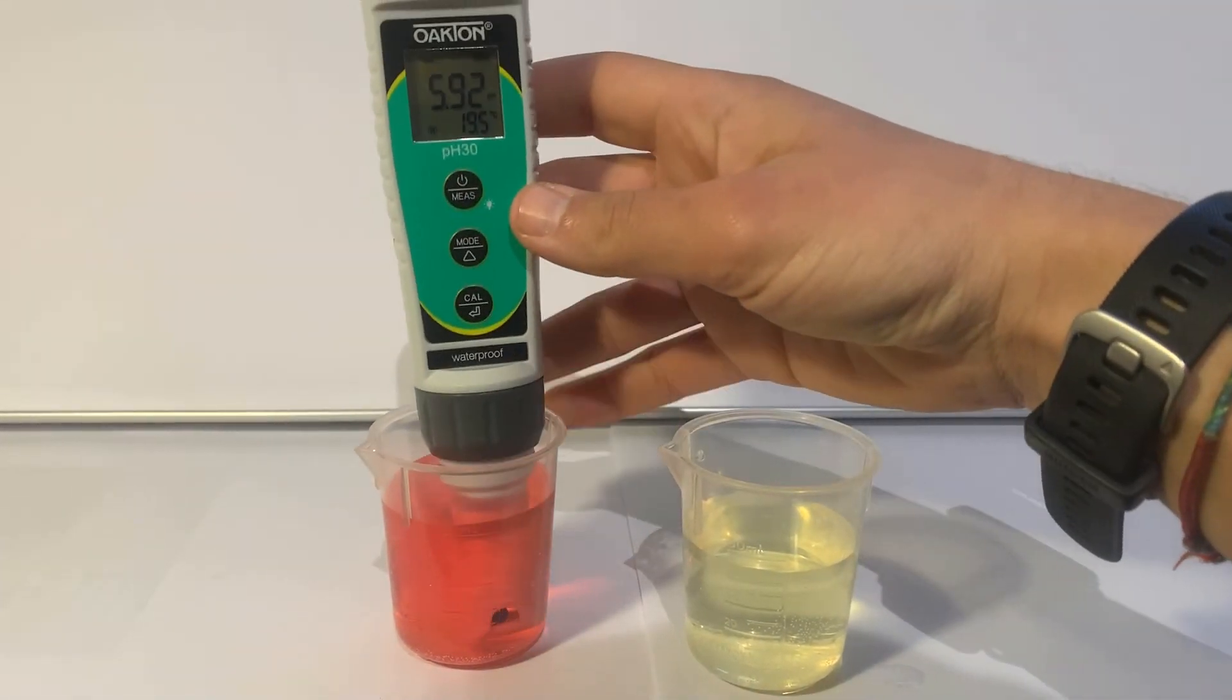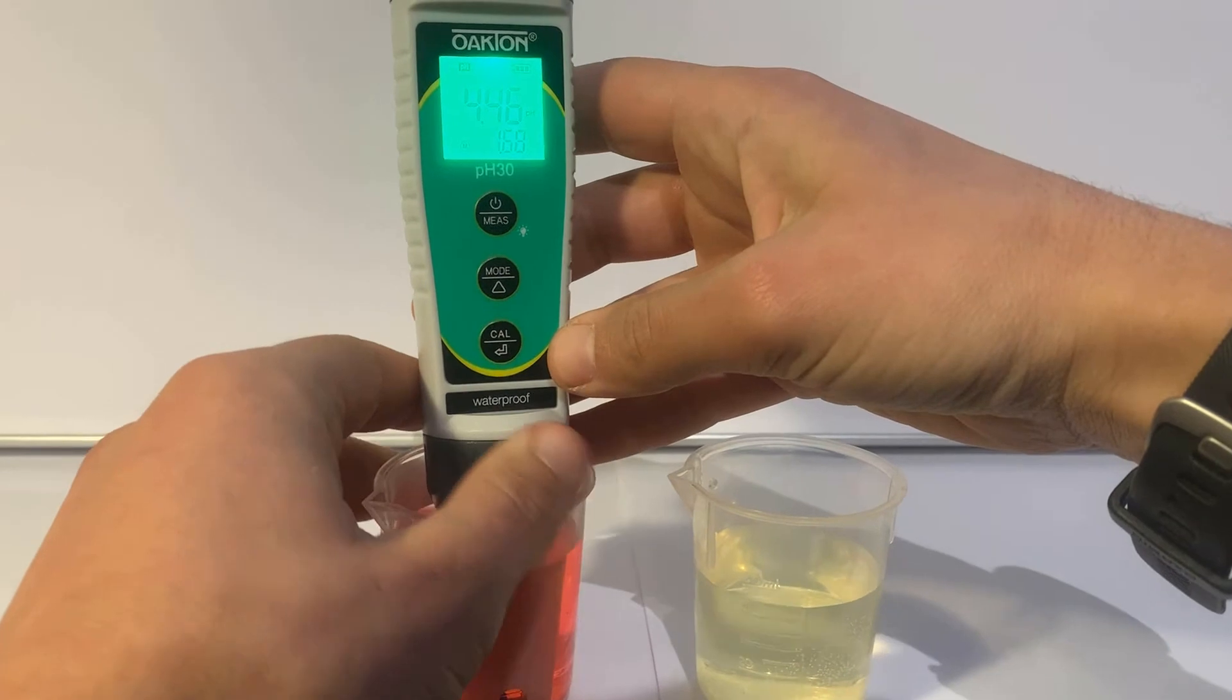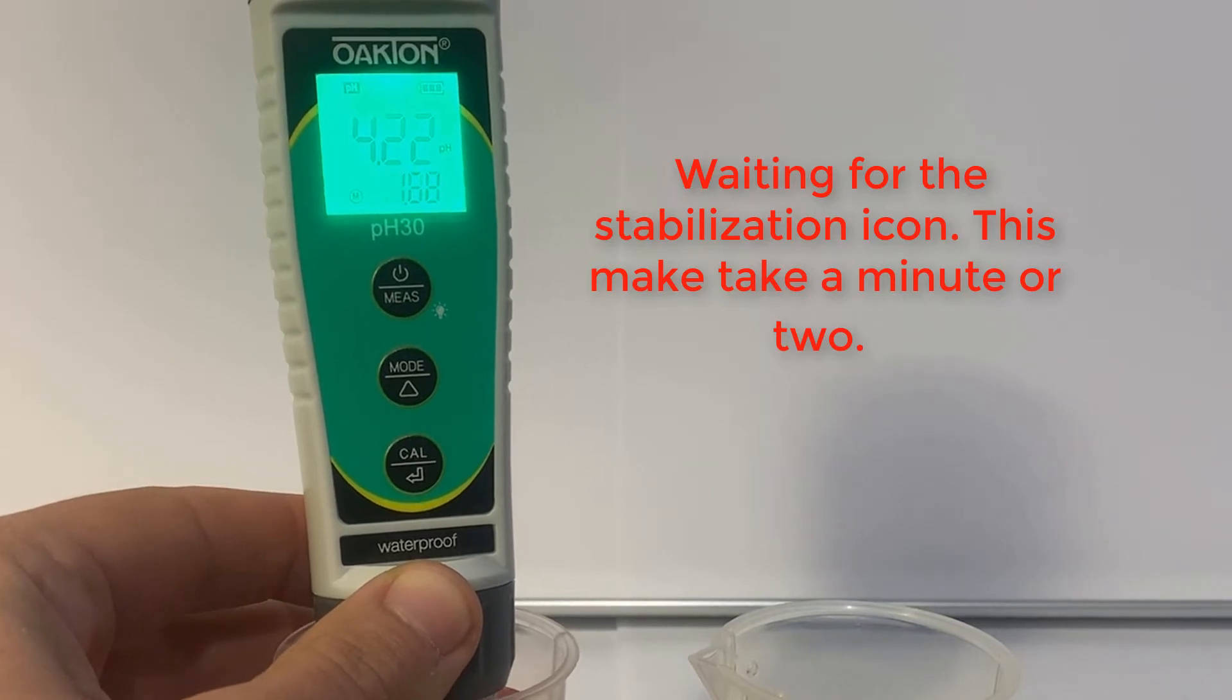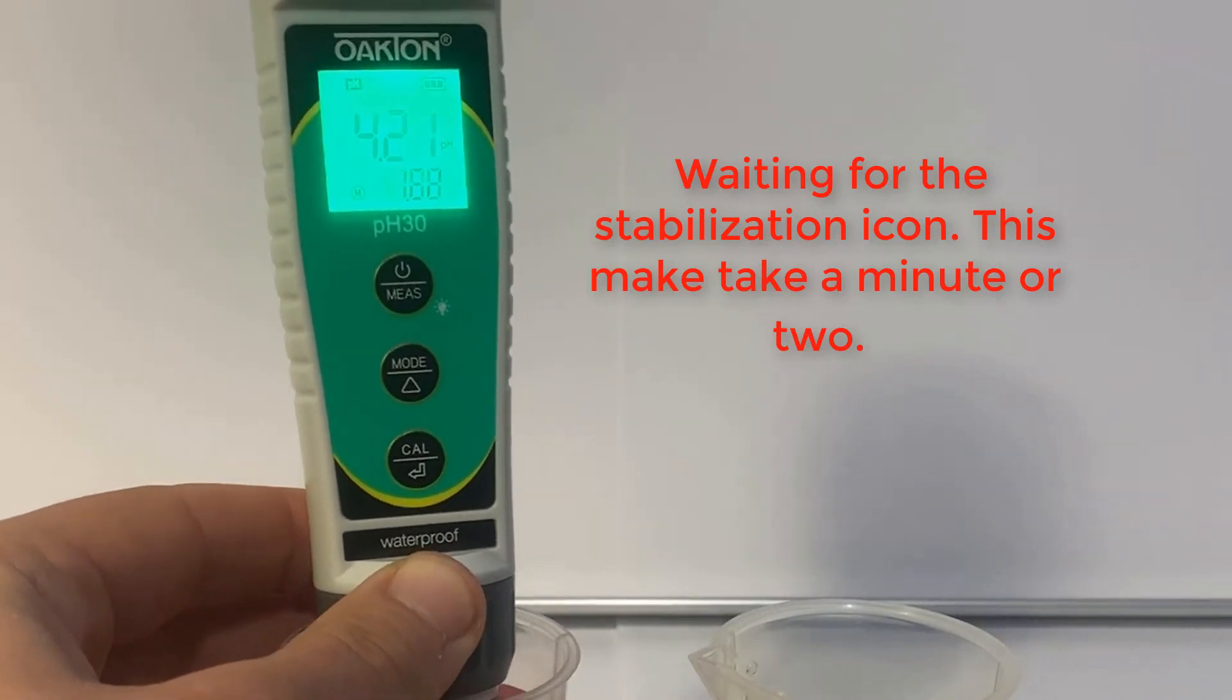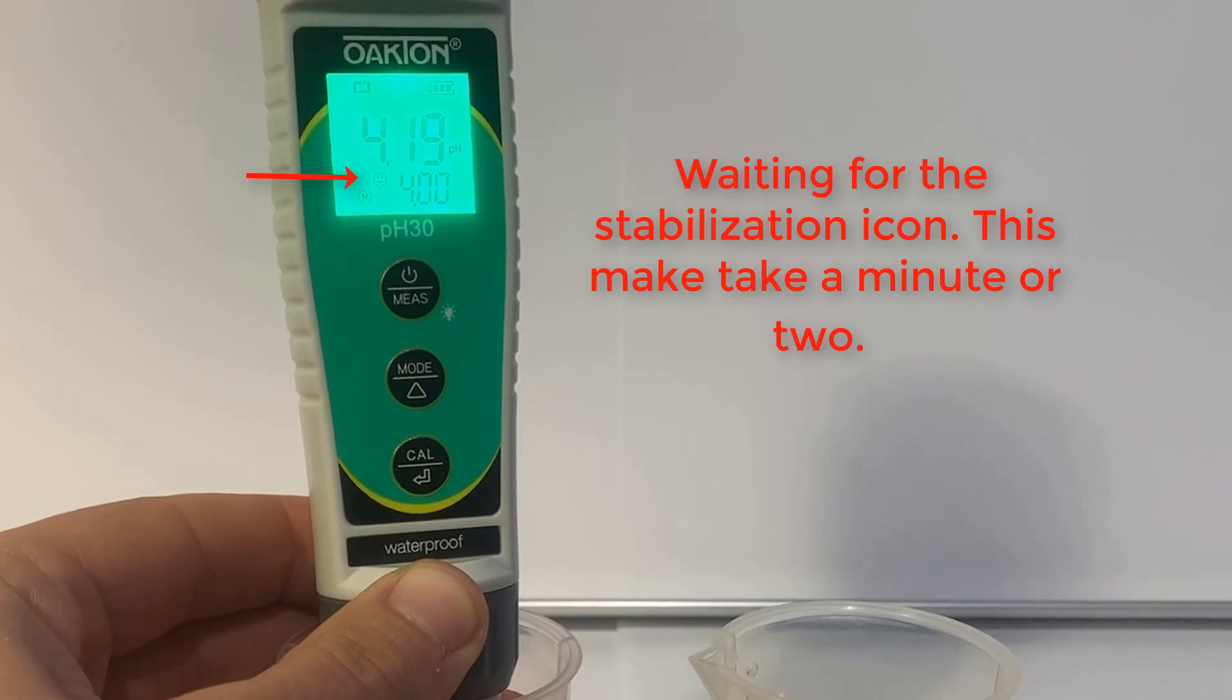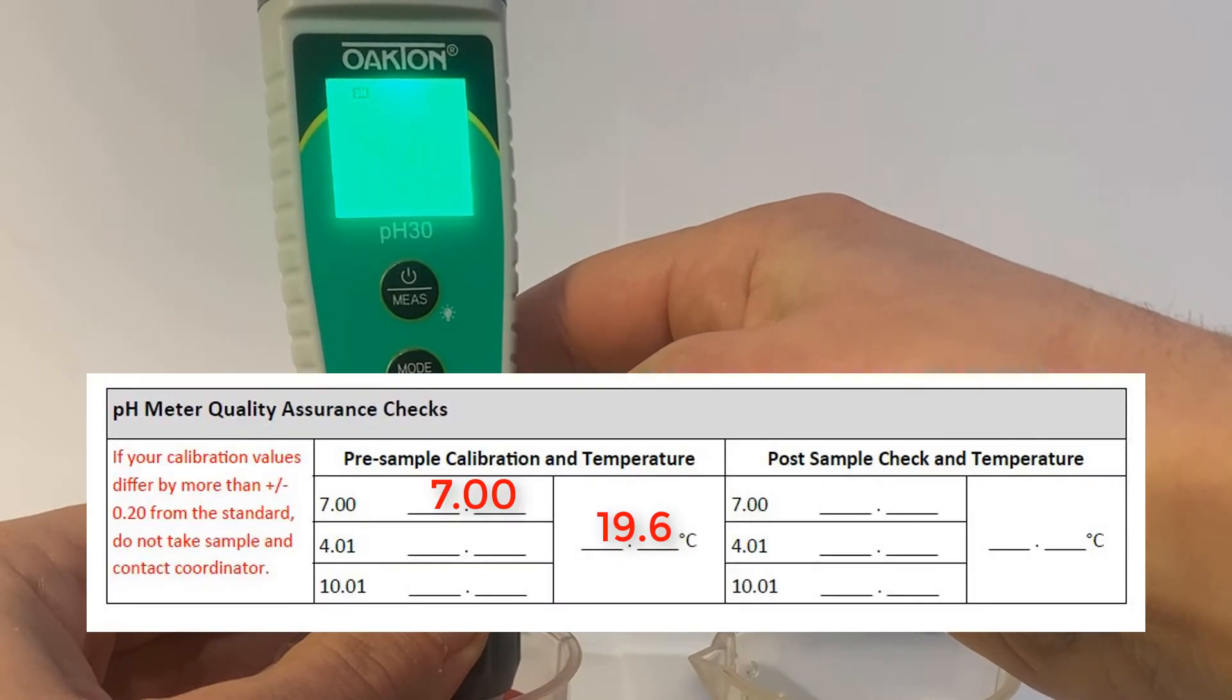Place your meter into Buffer 4 solution, long press CAL to enter calibration mode, and wait for the stabilization icon to appear. Short press CAL to save your calibration. Record the number that flashes on your data sheet.